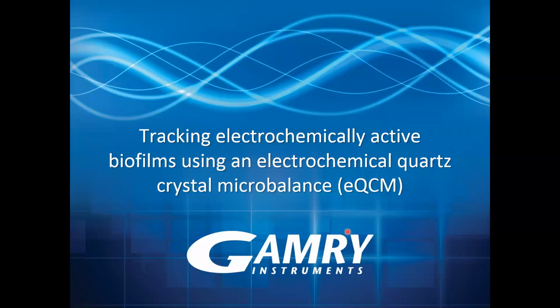I think everybody here wants to know more about how this electron transfer is occurring within biofilm, and what they can do with that information. This has a lot of implications, not just in microbial fuel cells, if you are familiar, but just detection in cells as a whole.